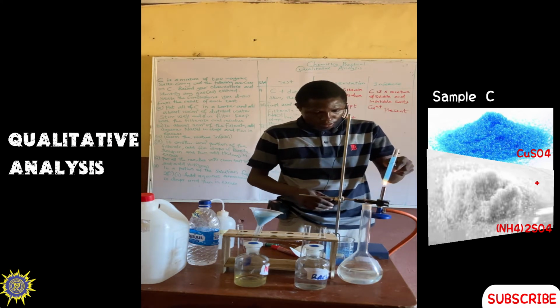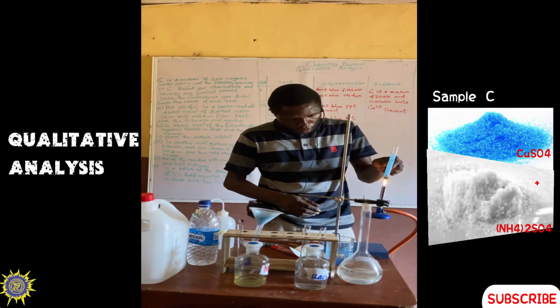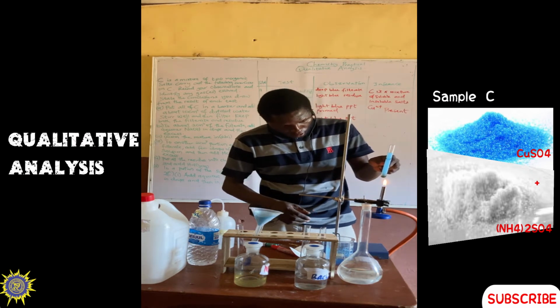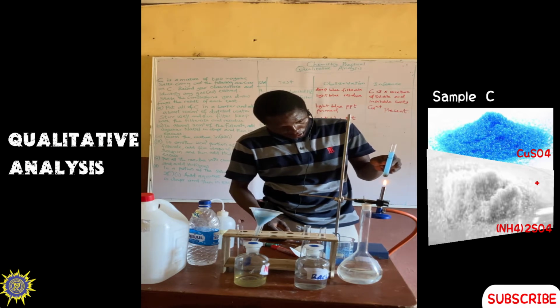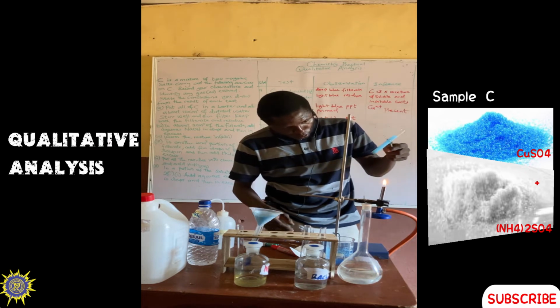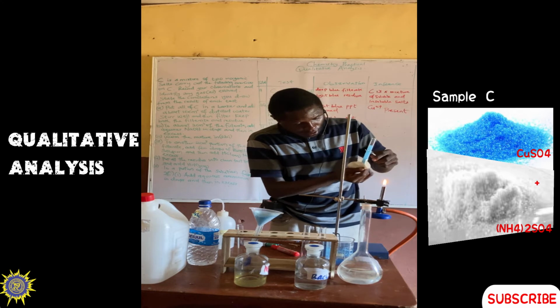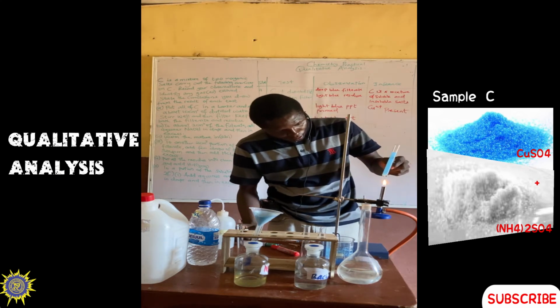I want to put it on the flame so that you can see the color changes very well. I need to clean this very well. Now just enough heat is enough.